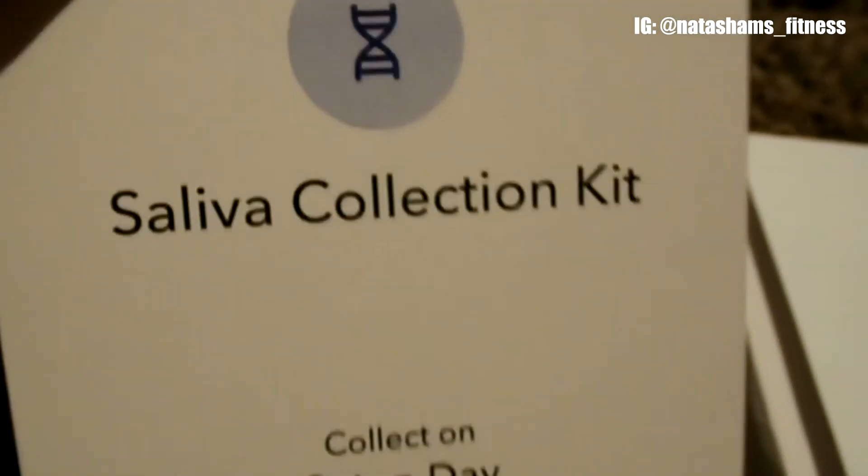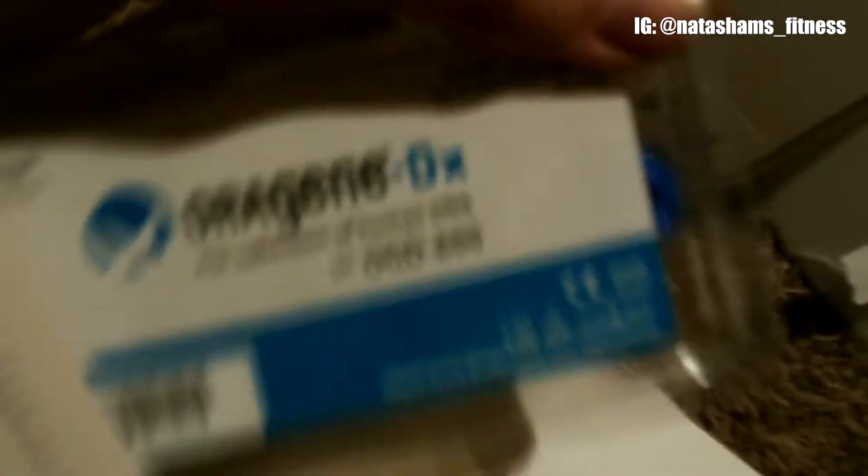Next we have the saliva collection kit. Here's what it looks like. I believe you just spit into that thing and then send it off to them to collect your DNA — so they can make clones of you. No, I'm just kidding.